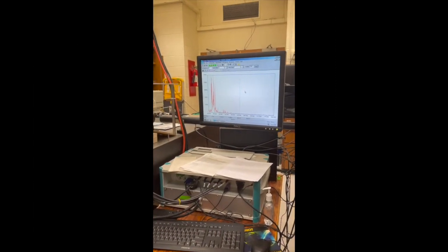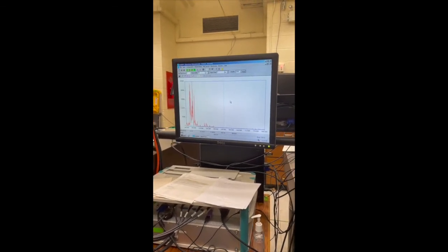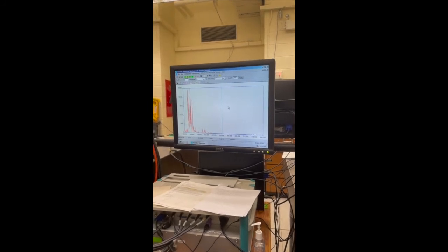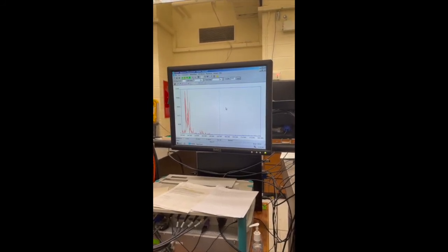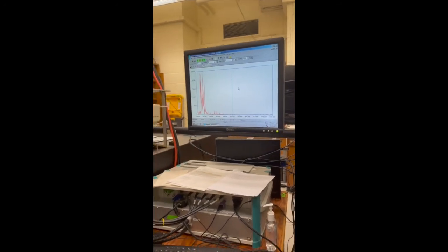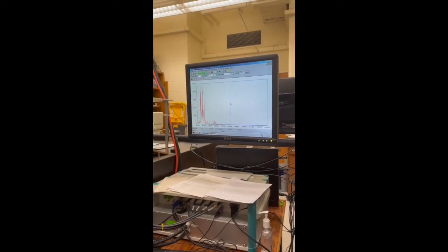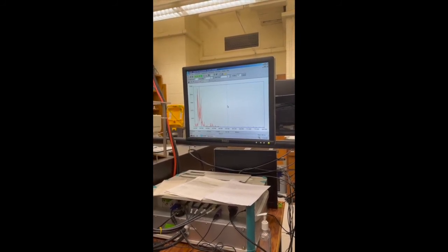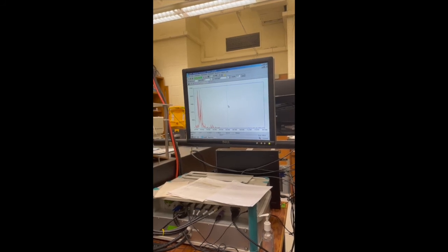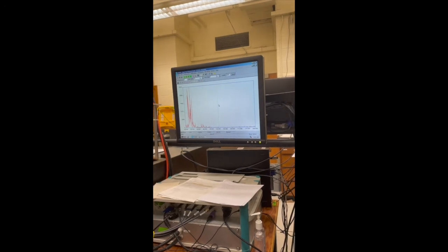So there's one more thing you'll want to do before you start taking the data that you're really interested in. Just checking to make sure that the spectral calibration is correct. The spectrometer doesn't actually measure the wavelength of a line. It just relates the position of the diffracted light to a preset calibration. So we have to check and make sure that that hasn't drifted, which it will do as the lab changes its temperature. So the way you do that is, remember that picture window we opened before?